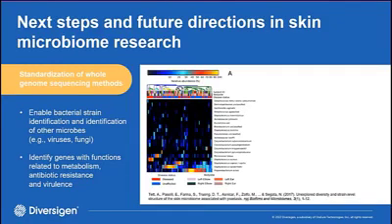As with 16S sequencing, implementation of shotgun sequencing or any other omic, including, for example, metatranscriptomics and metabolomics, into skin microbiome research requires standardization of the different steps of the pipeline, again, from sample collection down to data analysis. As mentioned, a great part of this standardization process involves the addition of a control sample, like a mock community. Once current and emerging technologies for skin microbiome research are standardized, then new and reliable information can be acquired in a more systematic way.